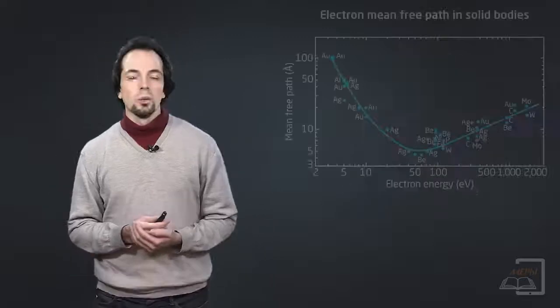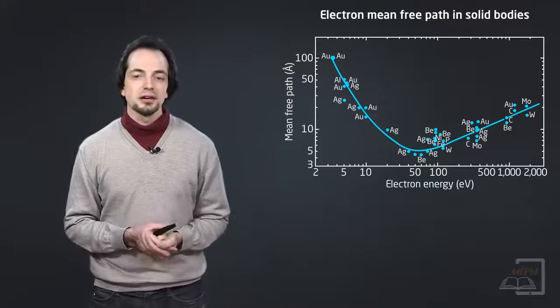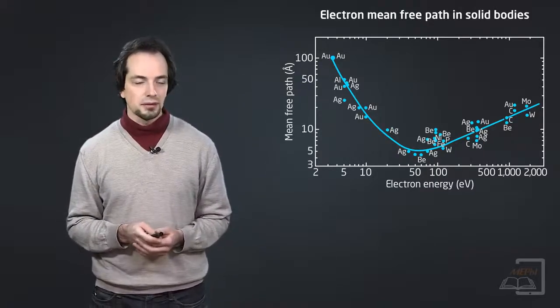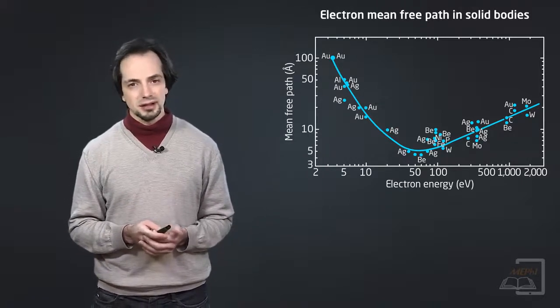Sometimes it's used. Well, these photoelectrons have quite low energies, and they are emitted from a very thin layer of the sample, usually several or maybe 10 nanometers.